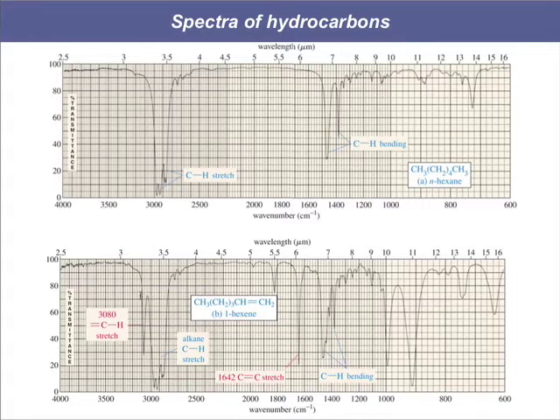We also see a new peak emerging slightly above 3000, close to 3100, and that is our sp2 hybridized carbon-hydrogen stretch. So comparing our 1-hexene to our hexane, we should see two unique vibrations corresponding to a terminal alkene, the carbon-hydrogen sp2 stretch and the carbon-carbon isolated alkene stretch.